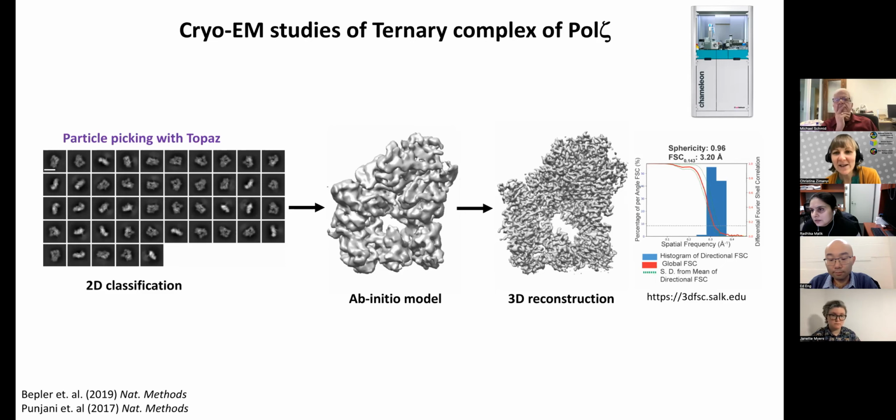And what software are you using to do that processing and make sure you're removing duplicate particles? We are using CryoSPARC now to remove the duplicate particles. And processing in general, we have done both, in CryoSPARC initially, and then we also do rely on other software as well.